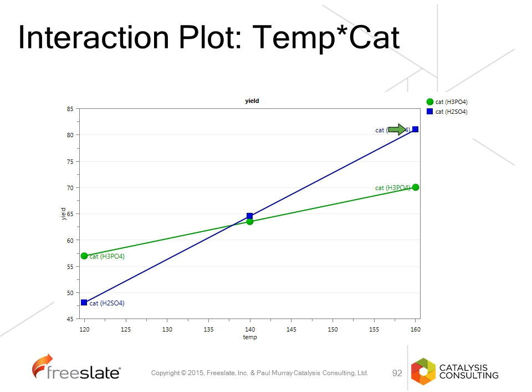If you had carried out and investigated both of these acids at 120 degrees, you would have chosen phosphoric acid. Having chosen phosphoric acid, you may have looked to increase the temperature, and you would have found a result of 70%, but you would have excluded sulfuric acid. If you had not carried out an experimental design, you would have missed that sulfuric acid at higher temperature can give you a much higher yield.